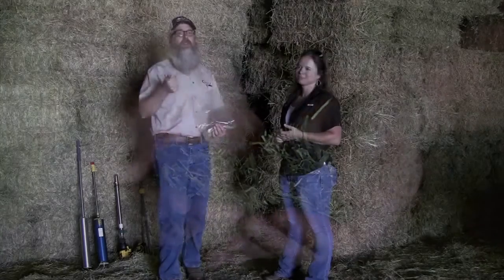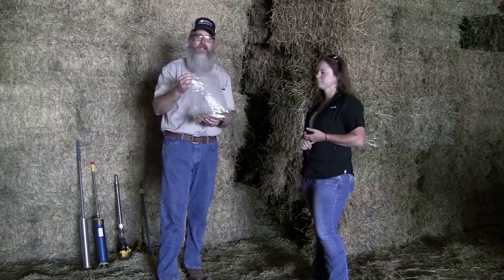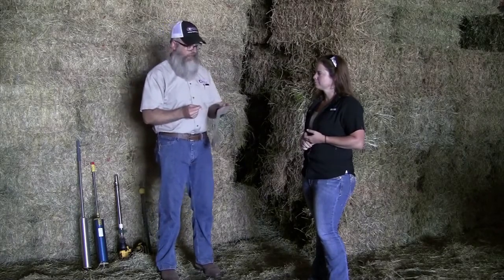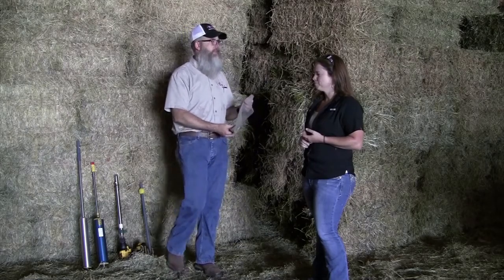So once you've defined your lot and you have gone out and obtained about 20 or 30 samples, and this is just one sample and it's already got quite a bit in here, we would need to take a quart-size Ziploc bag and basically fill it up. Now, this is a little bit bigger than a quart size, but we want to take at least a quart-size bag into our county office, and we want to have some labeling on there as well to say exactly what it is. So we take that to Lucy as our county agent, and what do you do with it, Lucy, from there?